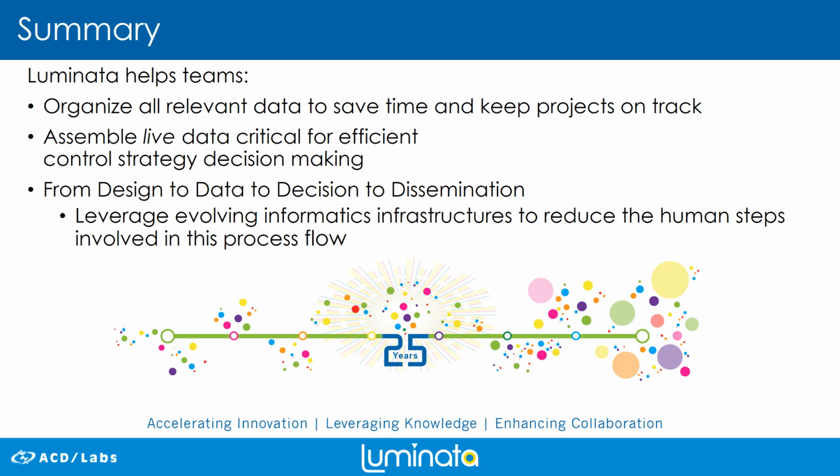By using the Luminata Web Portal, the chemist is able to view the process scheme and dynamically visualize the corresponding analytical and batch data. This is a decision support tool for any type of assessment, enabling you to make the right decision the first time around.